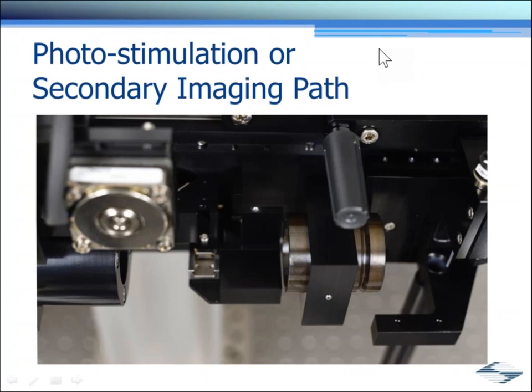Okay, I mentioned a moment ago the idea of accessing the beam path. This is one of the things that makes the Sutter MOM microscope attractive to many users, the idea of customization. So in this particular case, what we're looking at is a portion of the beam path. You actually see the scan lens right here very prominently. And so if you look just to the right of the scan lens, you'll notice the two scanning mirrors. Of course, the beam path is open and uncovered here, so I can show it to you.